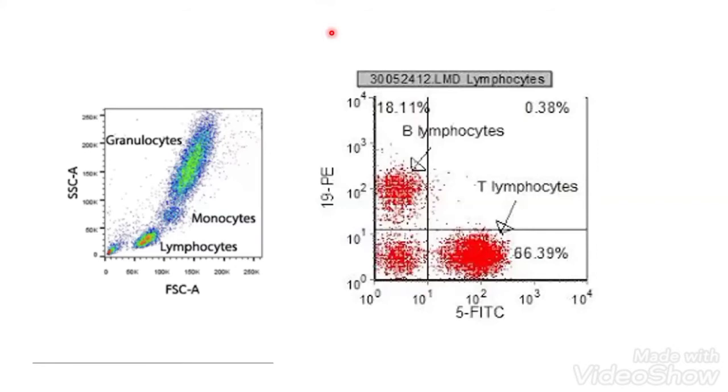I isolate T cells out of my blood, and I treat the T cells with that particular herbal extract or particular drug. After 3 days, I check for the activation markers present on my T cells by flow cytometry, and I can actually quantify how much the immune system is modulated, how much the immune system is getting activated more, what is the effect of that particular drug.